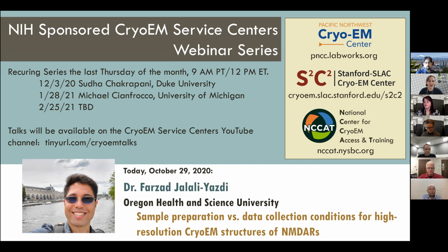Every month, we're hosting a user of the centers to present their work with a particular focus on cryo-EM methods. So along with highlighting the data that's coming from our microscopes, we hope these sessions are a useful resource for those of you who are newer to electron microscopy. And for that reason, we've made sure to leave plenty of time for Q&A at the end of today's talk.